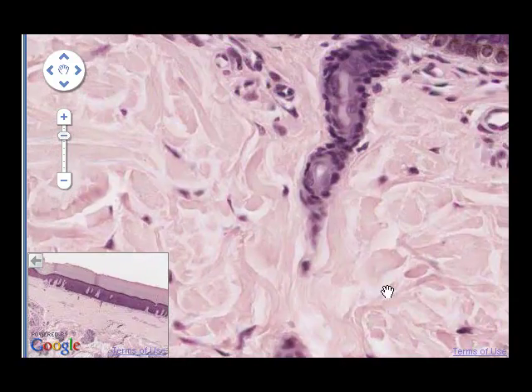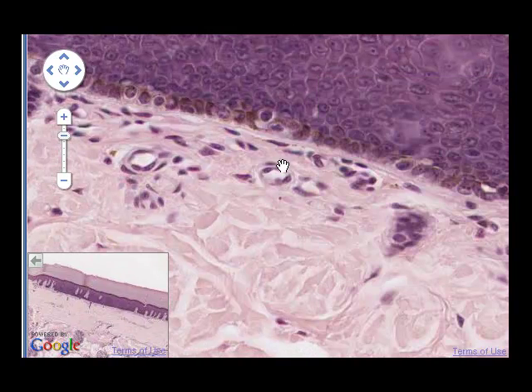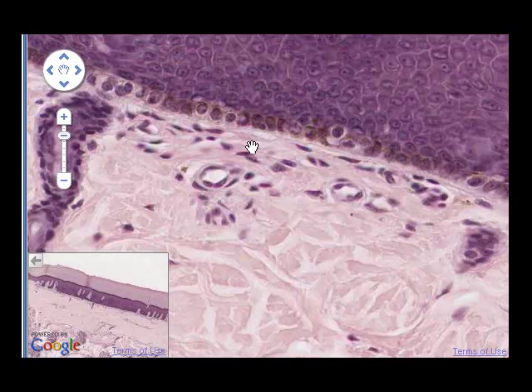If you look just beneath the epidermis itself, you'll notice that in a region immediately underneath it, the area is considerably more cellular, and you don't have fibre bundles quite as large as you see in the dense irregular connective tissue. And there are a fairly large number of blood vessels. Here's a very good example of one here with the squamous endothelial cells. And in this region where you have more cells and blood vessels and not the big arrangement of fibre bundles, this is what loose connective tissue found beneath the epidermis looks like.